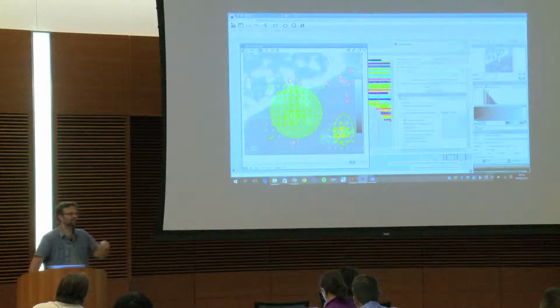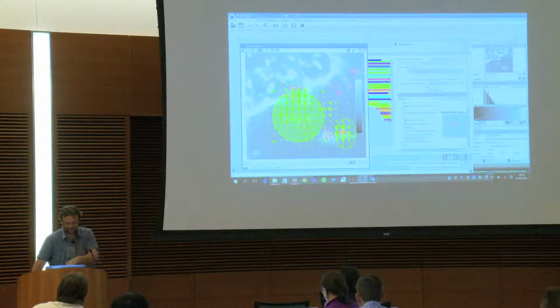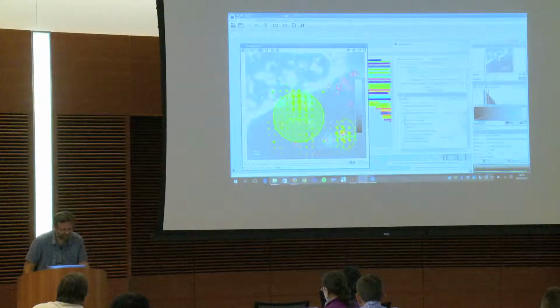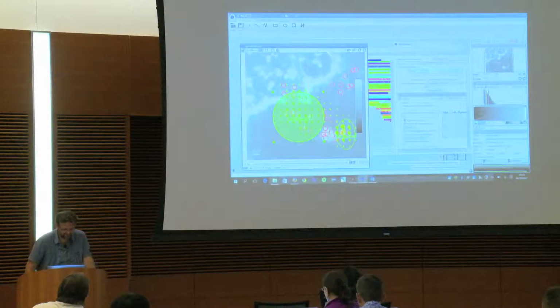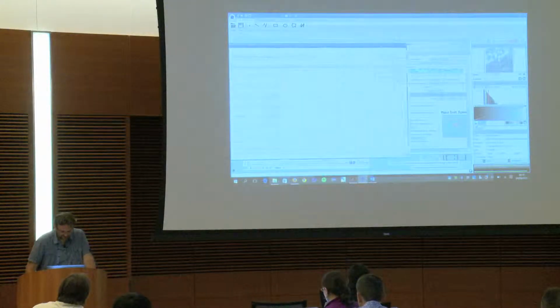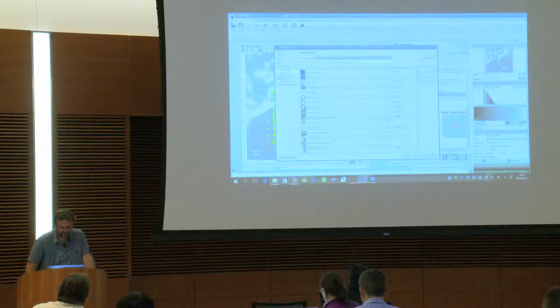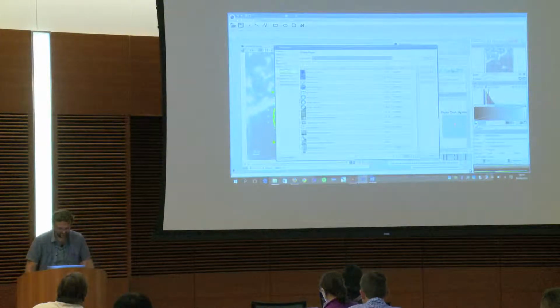A little story about the plugin install and direct run, like what you saw. Before, people had to go in here, to this jigsaw puzzle piece, and here you have the list of all the plugins. And by the way, it is here that you can select a private repository if you want to be outside of the public loop.